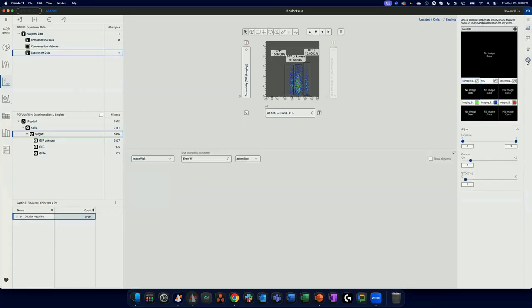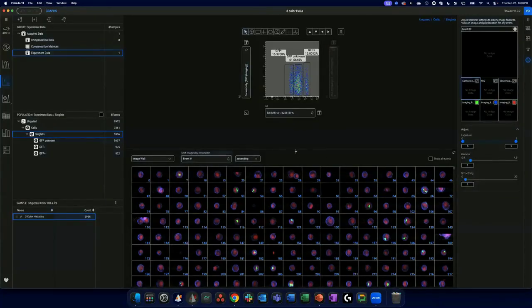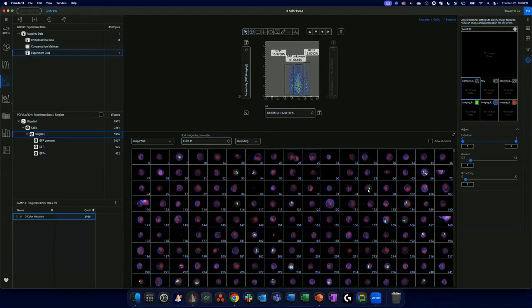We have an image wall feature where we're able to retrieve imaging information from the extracted TIFF file, so similar folder structure, but all that same functionality. And I can even make this a dark theme, which is always my favorite to do for imaging data. Okay. So I can still select images to preview them. I can change colored overlays, filter information, brightness, contrast, all of that.